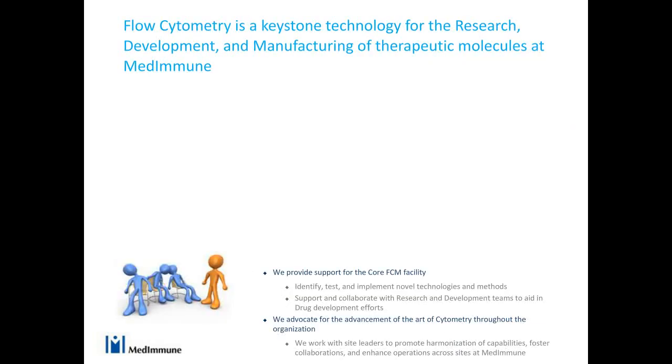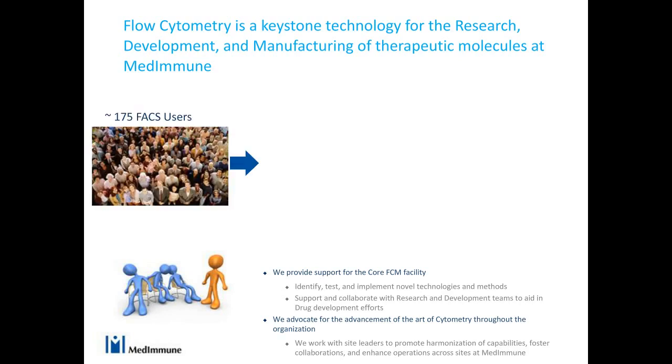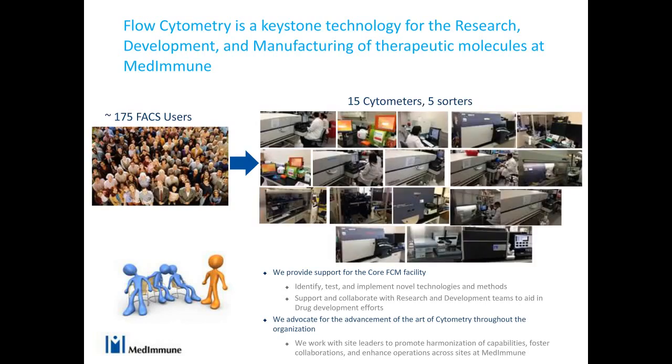As such, utilizing monoclonal antibodies as drugs, we believe that flow cytometry is a key tool for immunology and a keystone technology for our research, development, and manufacturing efforts at MedImmune. We have over 175 users at our site and over 15 cytometers and 5 cell sorters. We are a core facility and provide training and support to our users.